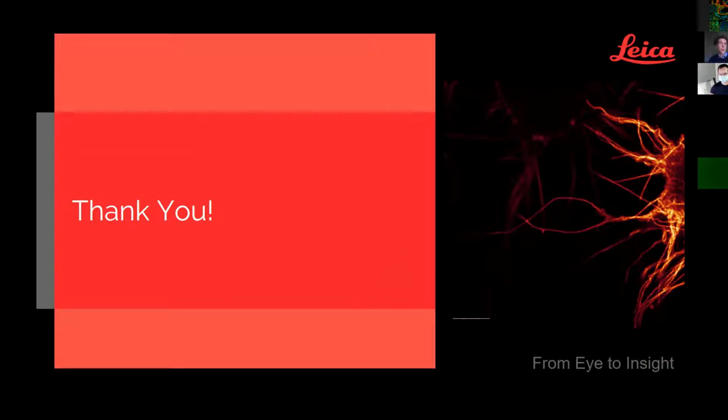Whereas now we can really see in parallel, thanks to the lifetime information that we have for every pixel, is this now a high resolution or is this a low resolution pixel? And if you want to tune to as high a resolution as possible, then of course you want to get rid of all the shorter lifetimes. If you also want to consider a little bit of signal to noise ratio, then you want to include more of the shorter lifetimes and maybe sacrifice a little bit on the resolution. But the good thing is you can also decide that once you already have your data. You don't have to acquire a new experiment for that.